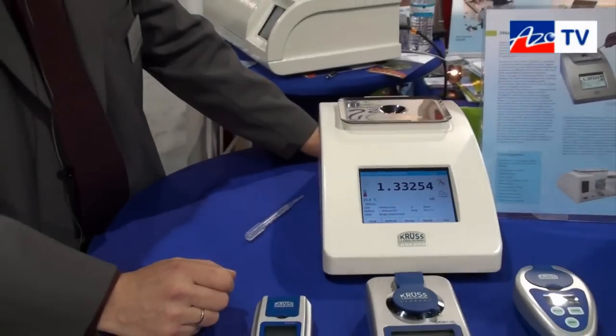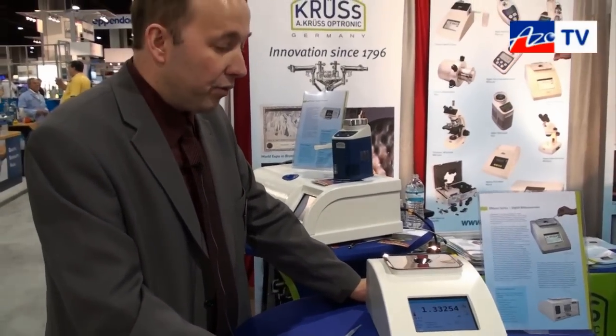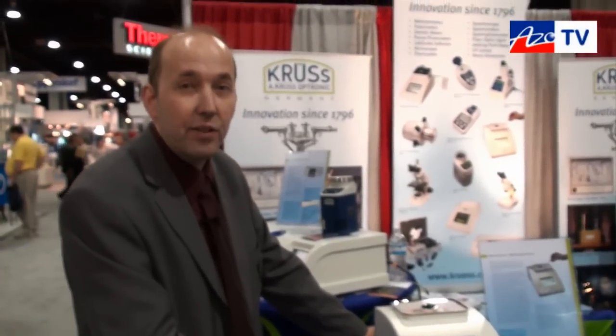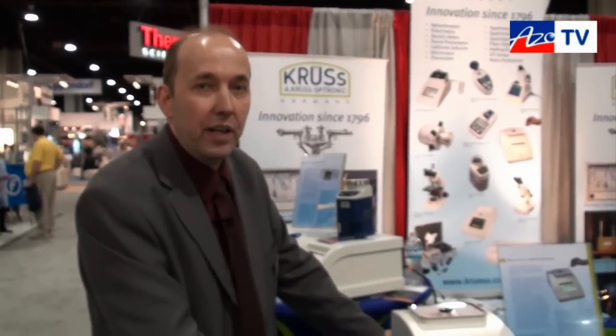Stefan, what range does it measure? What's the refractive index range? We have two different ranges: from 1.32 up to 1.58, and 1.7 is the other range of the instrument.